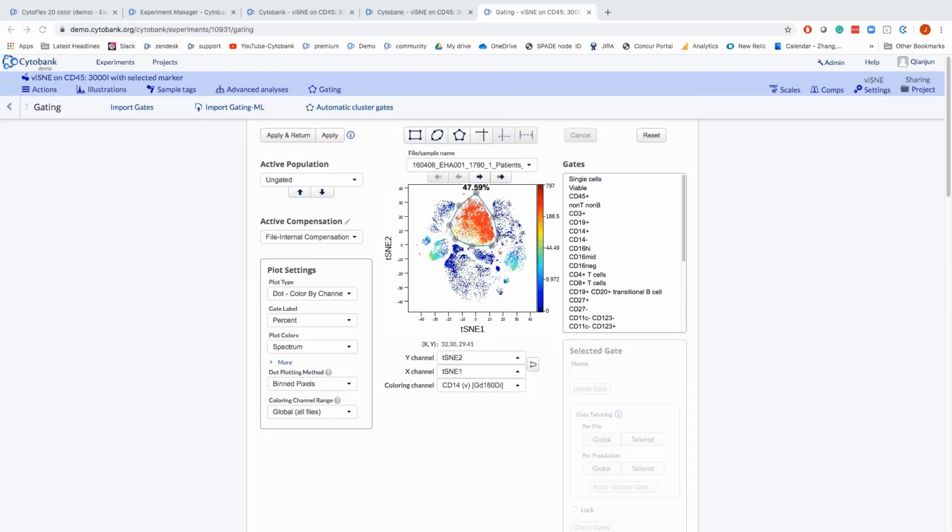All right, so we're going to get a little more technical again, and some of our users would like you to explain what the theta parameter is and what the difference is between theta and perplexity. Excellent. I can take the question, and Steph, if you have more comments, please add.